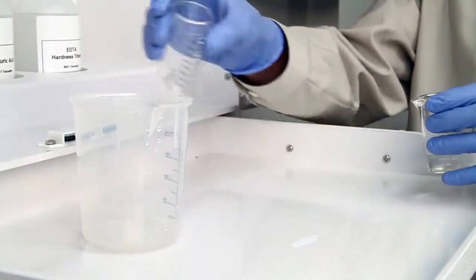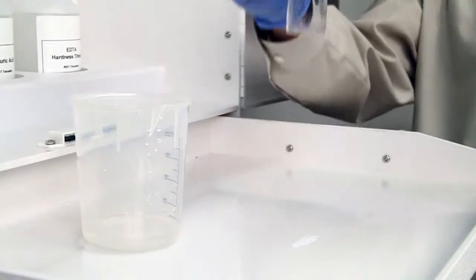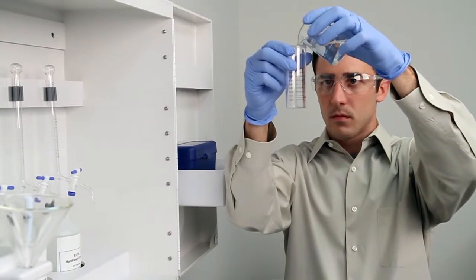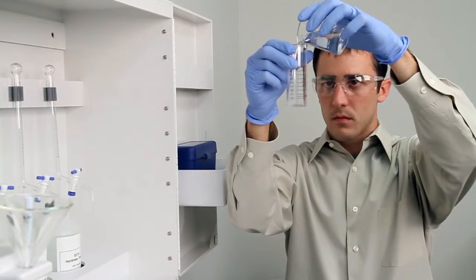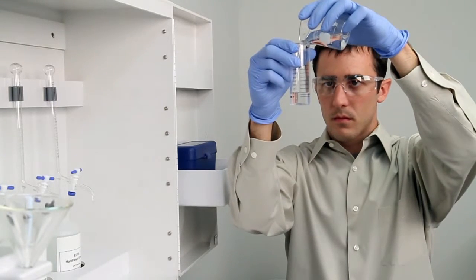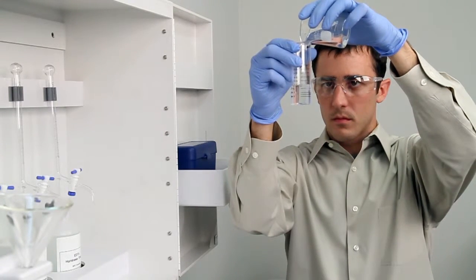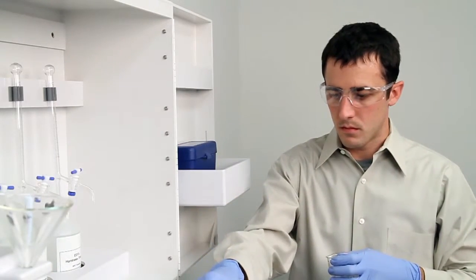Hold the vial close to eye level while pouring to ensure you have an accurate sample. Place the vial on a level surface and bend down to eye level to verify that you have collected an accurate sample. The slightest change in sample size will lead to inaccurate results.